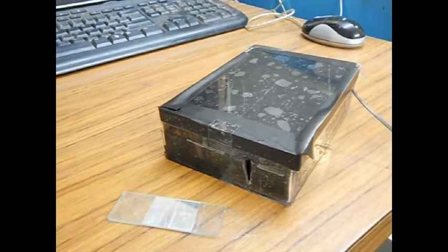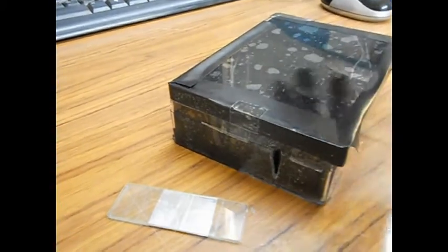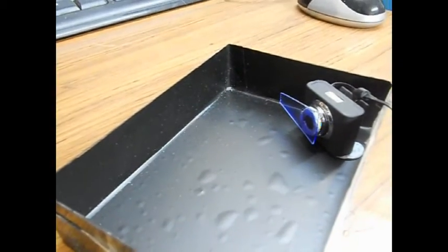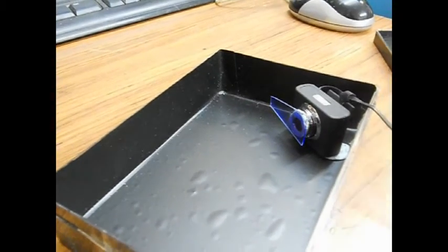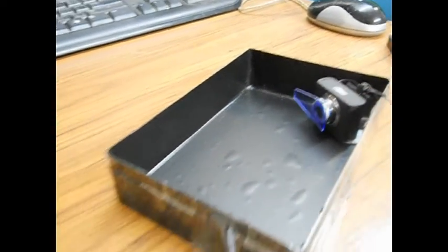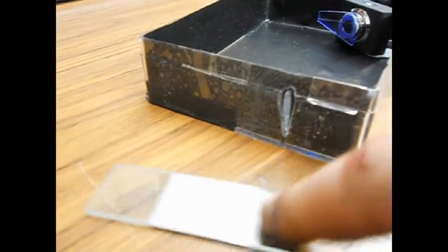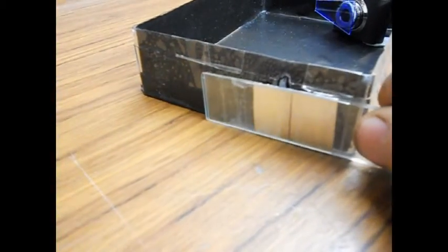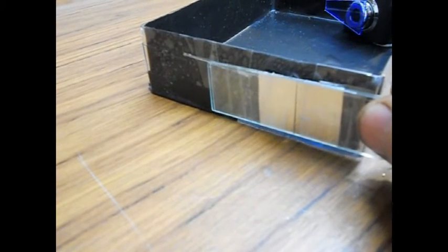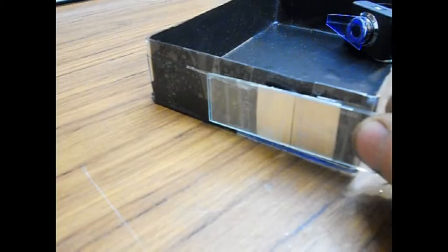We're detecting that really comfortably at 592 nanometers after using the basic calibration. This was the first time we tried to use the PLOTS spectroscope inside the classroom. The spectroscope itself is a box with a cheap $5 webcam, with some DVD plastic placed in front of the lens, with an aperture at the front of the apparatus refined by placing a slit manufactured from two pieces of aluminium foil sandwiched between two microscope slides.